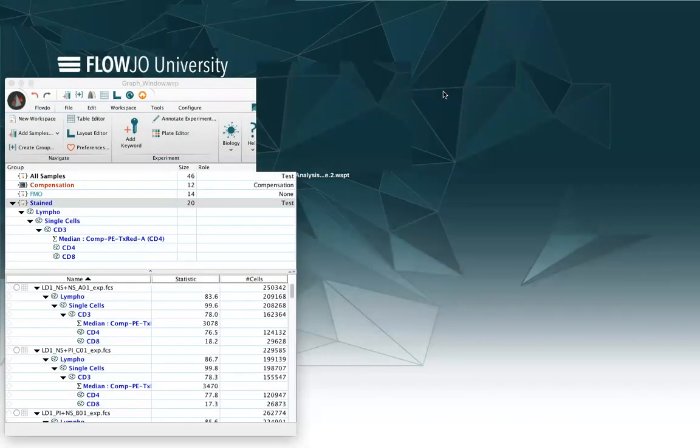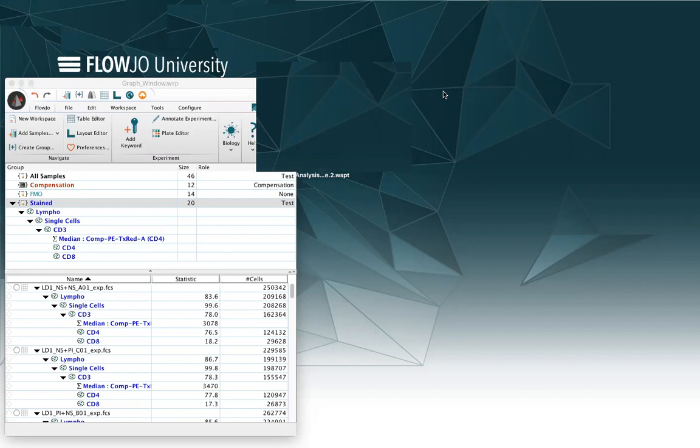Hello, this is Serena Di Cecilia, and I'm the European Application Scientist for FlowJo, and today I will show you how to create templates and how to use them.